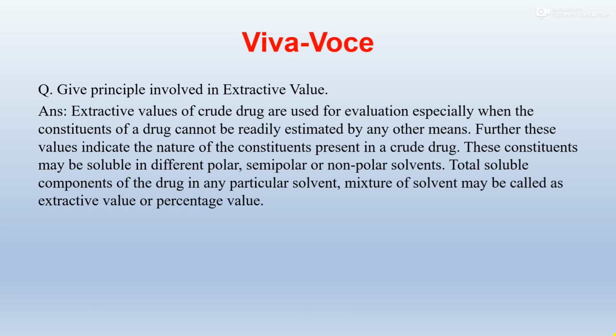So the questions that may be asked: give the principle involved in extractive value. Extractive values of crude drugs are used for evaluation, especially when the constituents of the drug cannot be readily estimated by any other means. Further, these values indicate the nature of the constituents present in a crude drug.